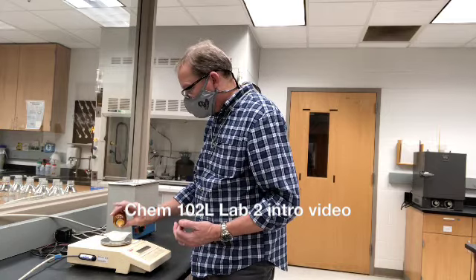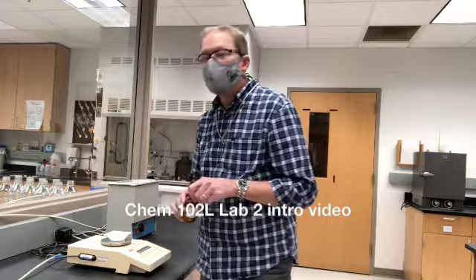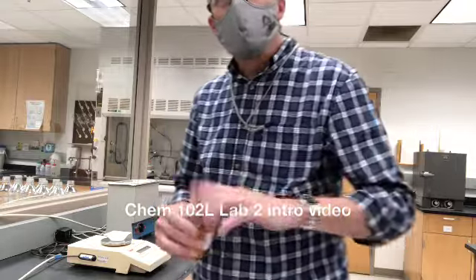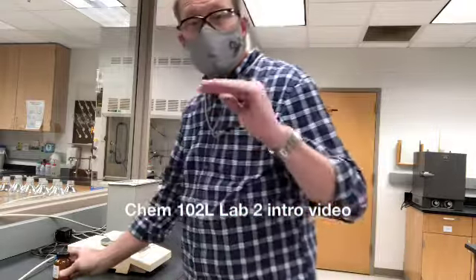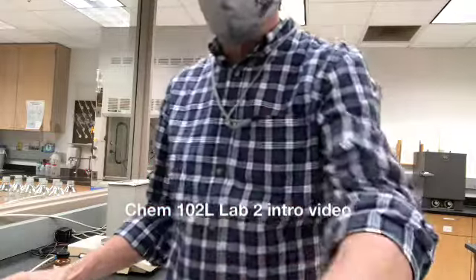3.65, and I would just now want to gently tap and wait, and I've got 3.97. So that's close enough to 4. I'm not going to fuss around and try to get it to 4.00. I know it's close to 4. Now I want to know exactly how much I put in there, and I want to put it in the vessel that I want to measure.